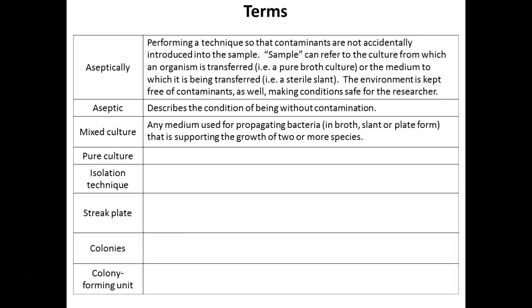Yeah, the one that's labeled mixed. Right, if you did what we're going to do today and you got different growth patterns, or if you do like we're going to do next week and you get different shapes, then you probably have different organisms, unless it's one that doesn't hold a particular shape, right? So really, other than testing it, just looking at it, if I didn't tell you, you wouldn't know, right?